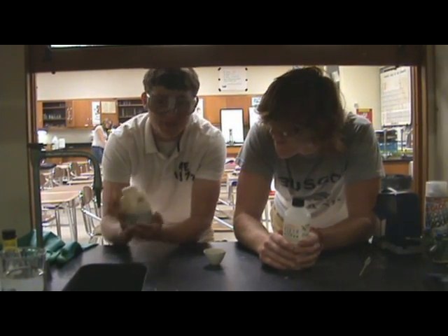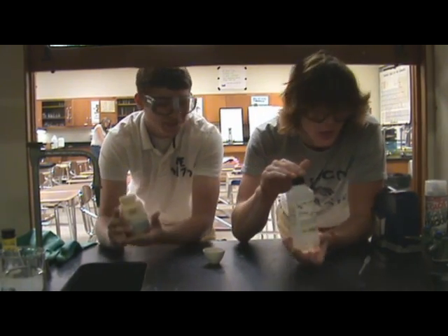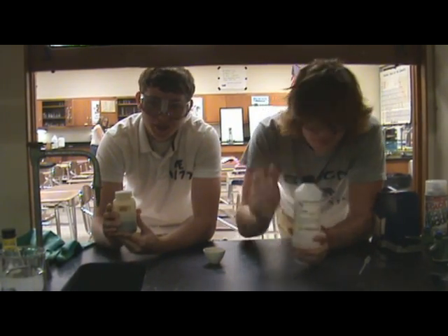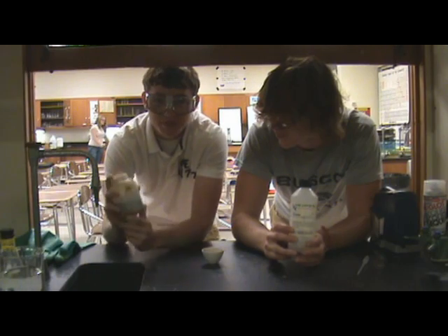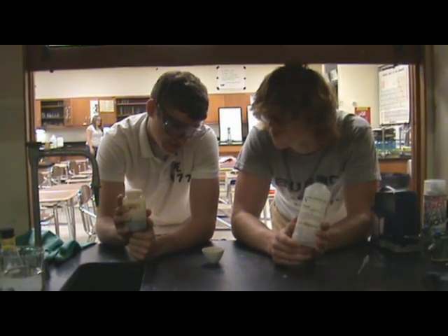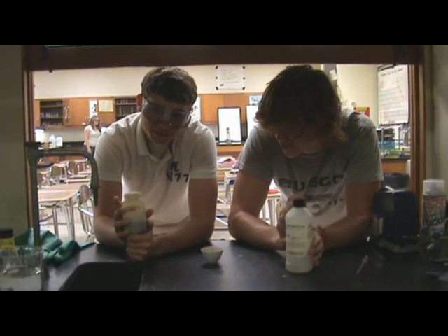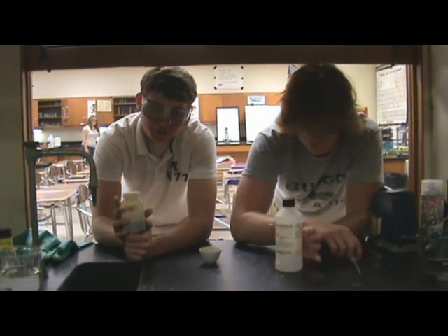So what we got here is potassium permanganate crystals and glycerin. And when you mix them, potassium permanganate is a strong oxidizer. This is a strong oxidizer. So when they mix, the combustion reaction occurs.